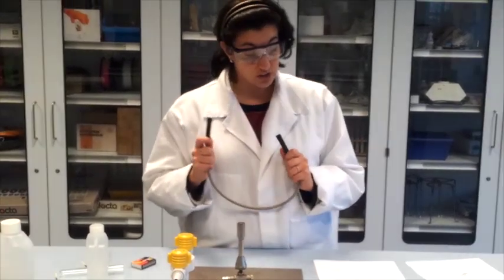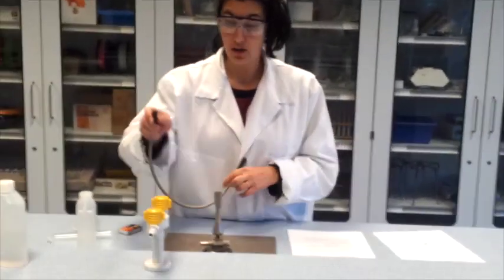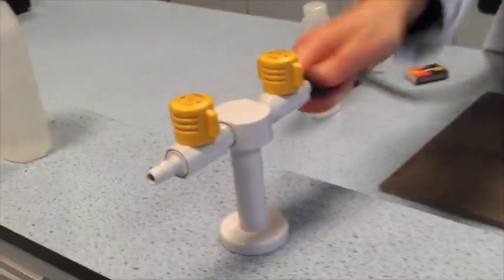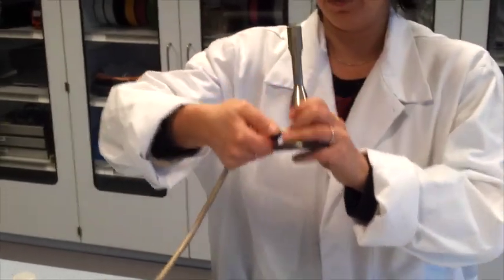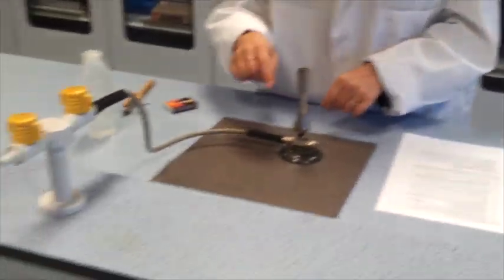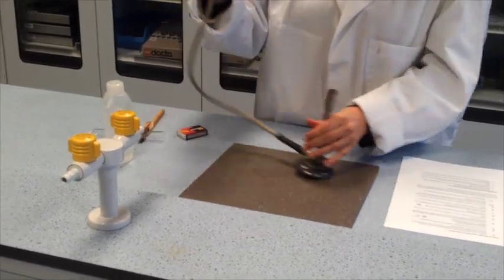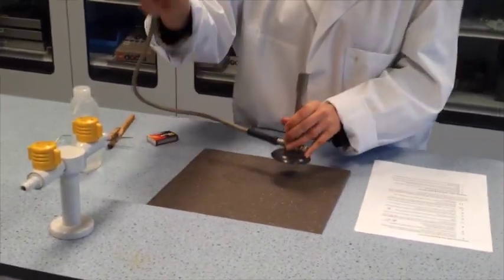Then we are going to attach the rubber tubing firmly to the main gas supply by a turning motion and to the Bunsen burner. I do the main supply first because otherwise I can pull around the Bunsen burner and it might fall on the floor.